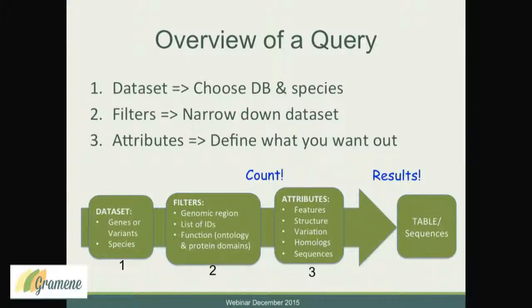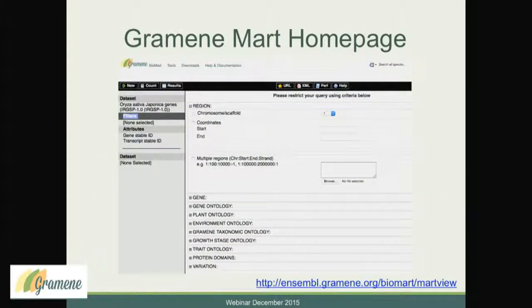And you can always trace back your steps. There are two nice features for these. One is going to be the count button that will allow you to monitor whether you are actually getting the set that you want, that you're narrowing something, and the results, which is going to give you the tables in different formats. So let me show you again in that homepage where you'll have these steps before we go into an actual demo, a little video recording for it.